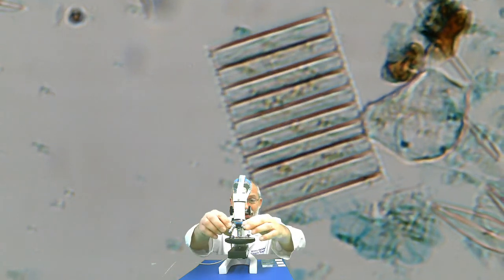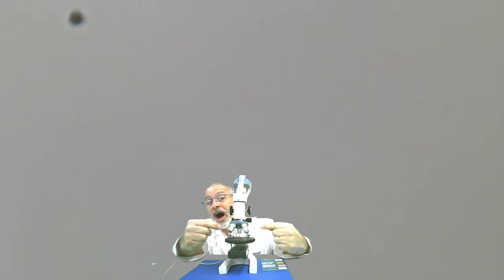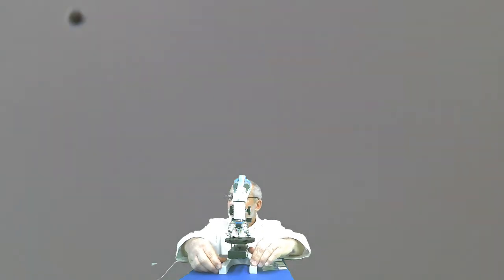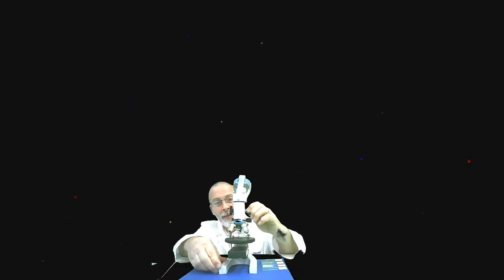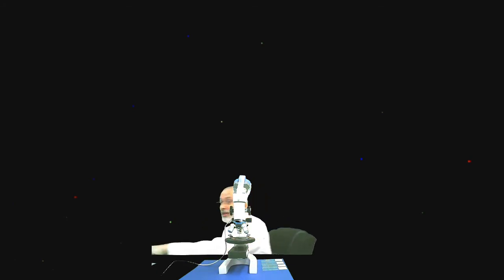All right, so I'm going to move it over to 40 magnification, which is also our low objective power. I'm going to turn my lamp off now, clickety-doo-dah, and I'm going to lower the body tube with the low objective power. I'm going to go get the case, or rather the cover.